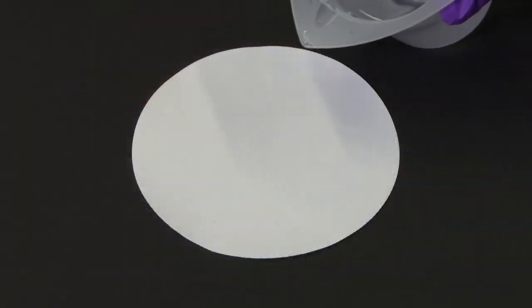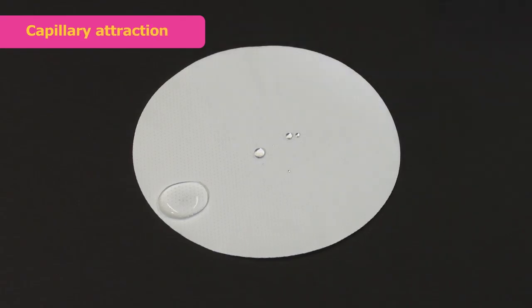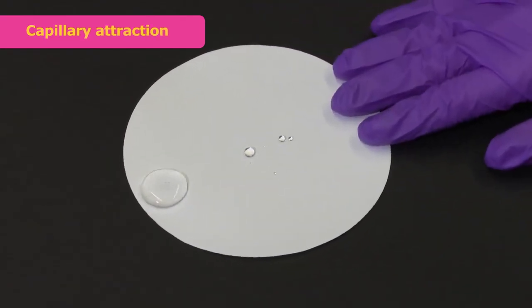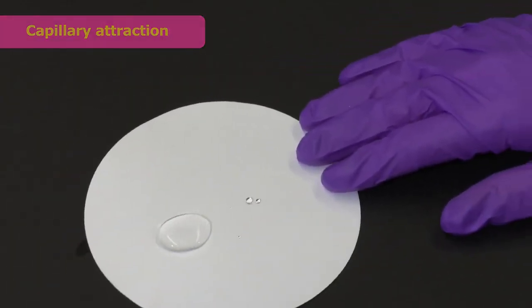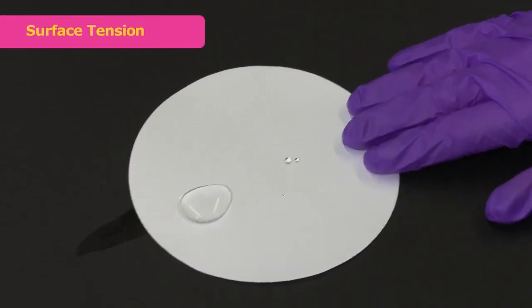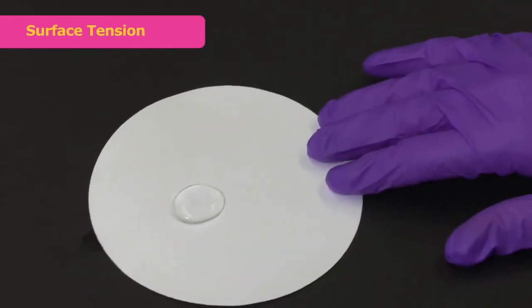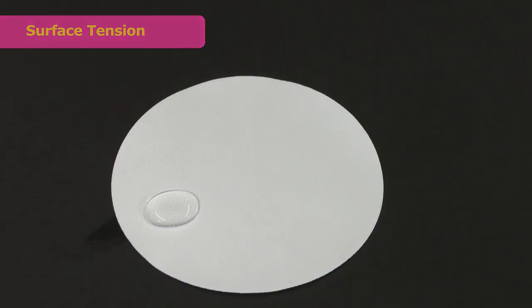Capillary forces are the result of intermolecular attractions between liquid molecules and each other and between liquid molecules with a contact surface. The measurement of liquid-liquid attractive force is known as surface tension. I can demonstrate by putting water droplets on a very hydrophobic membrane. You see, as the water drops get near each other, they combine. Surface tension is the attractive force pulling the water drops together.